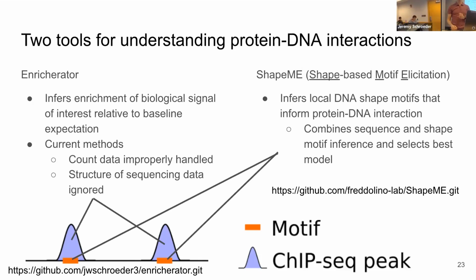Go ahead. Yeah, so there's an example you asked about earlier, like where we have 100 counts at I, and then you probably have close to 100 counts at I at this one location, right? Yeah. With this algorithm, are you worried about losing spikes that are biologically relevant? Yeah, that's a good question. And in case the mic didn't pick it up, I'll repeat it. Basically, the question was, are we concerned about loss of resolution, like genome space resolution, with this kind of local pooling of data?